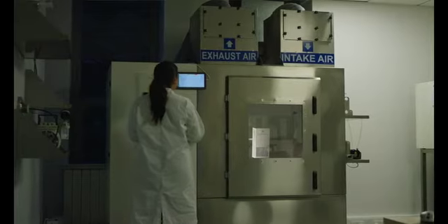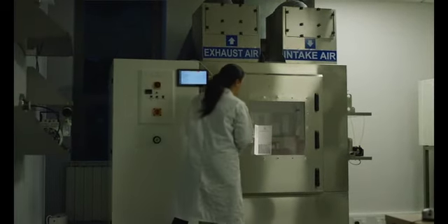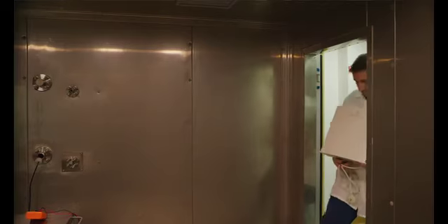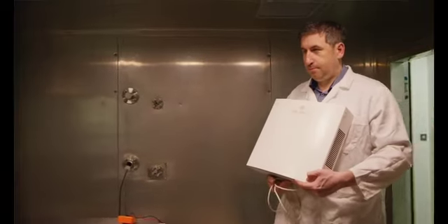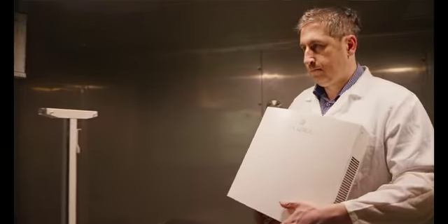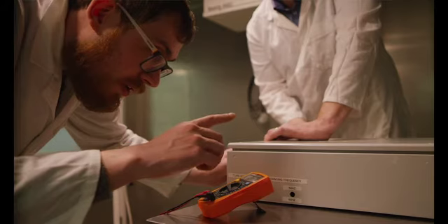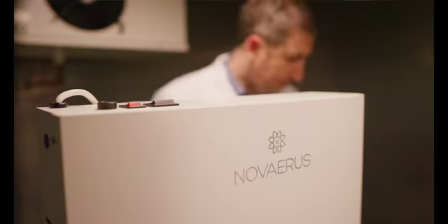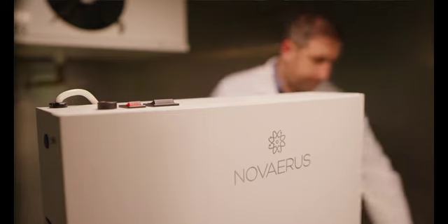When the tests are completed and we're happy with the results, we can then test the product in a larger 30 meter cube chamber which is a chamber similar to the size of a room and it matches very closely with the type of chamber that we would see at compliance laboratories and other major third-party laboratories across the world.